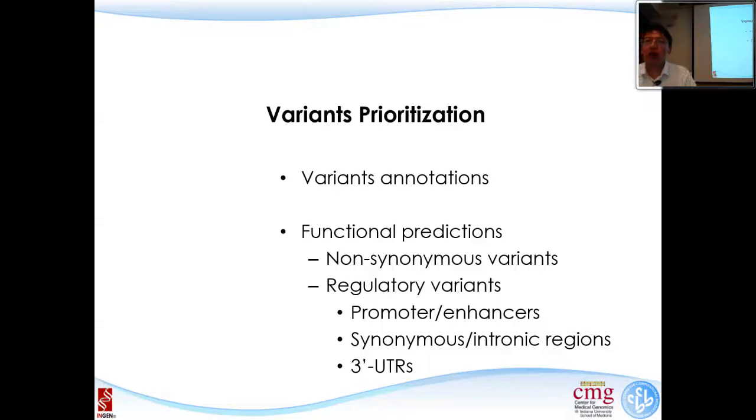So now I'm going to switch gears to variant prioritization. What we're trying to figure out here is this: you have some DNA, you get a sample, you extract the DNA, you do the sequencing, and then you go through all the steps that we went through. You did everything right: quality control, quality recalibration, sequence alignment, refined alignment, variant identification, variant recalibration, and then statistical analysis.